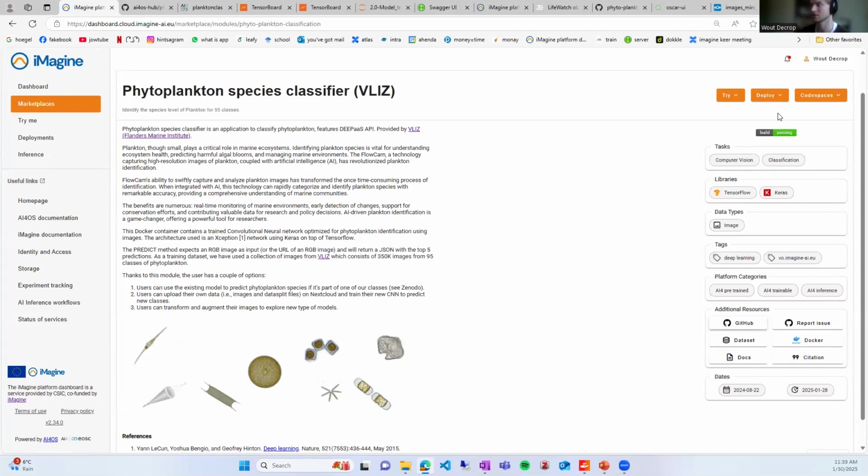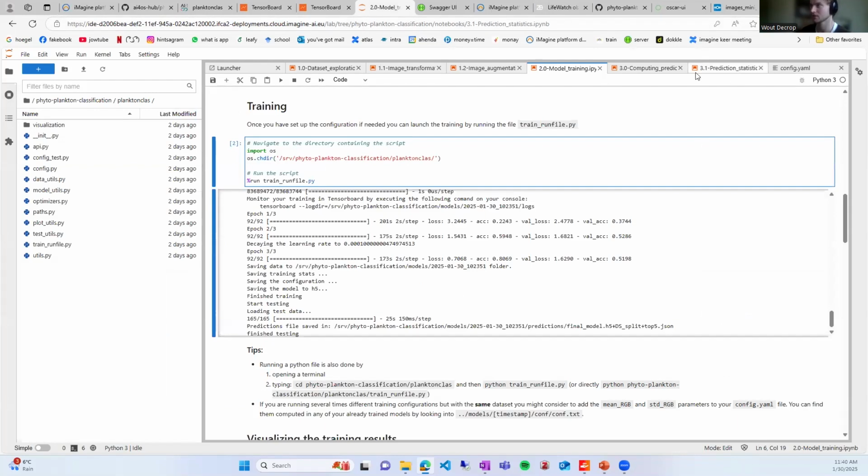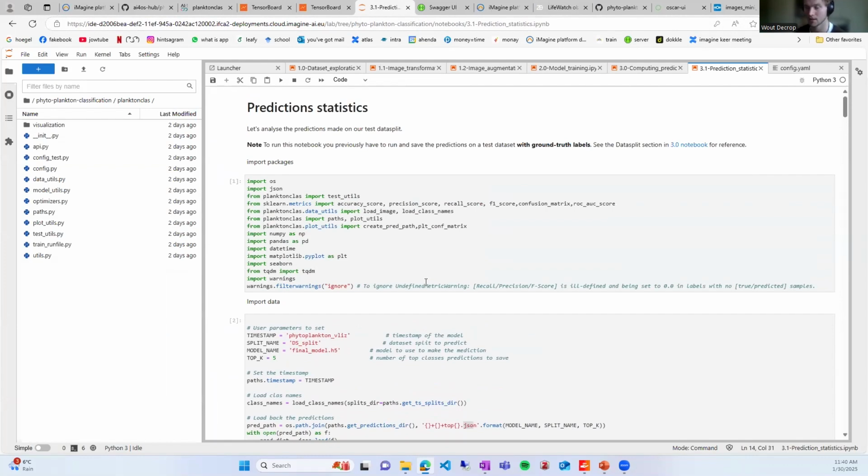If you want to do predictions, you can use Oscar through Python scripts. You can train within the notebooks. You can train through the API. You can train on your own resources. You can do a call-in. There are many different options. I hope I explained it quite well. I can go deeper if there are any questions, if I went too fast over some of these notebooks. But let me know if you have any questions.